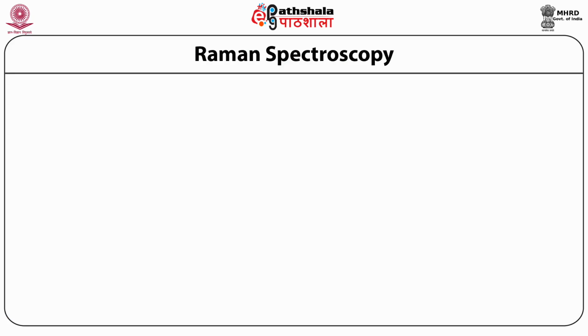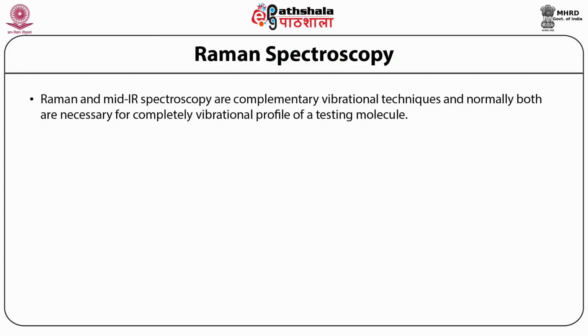Raman spectroscopy. Raman and mid-IR spectroscopy are complementary vibrational techniques, and normally both are necessary for a complete vibrational profile of a testing molecule. Although some vibrations may be active for both IR and Raman, these two forms of spectroscopy arise from different methods and different selection principles.